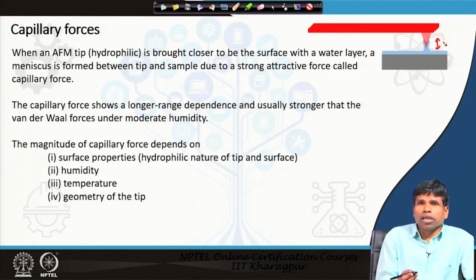Theoretically, atomic force microscopy can function in any environment, but under ambient conditions there is always a water layer present on the sample surface, and the sample surface is masked by that water layer, so we will not measure the correct van der Waals forces.